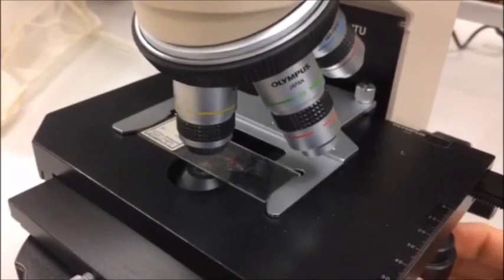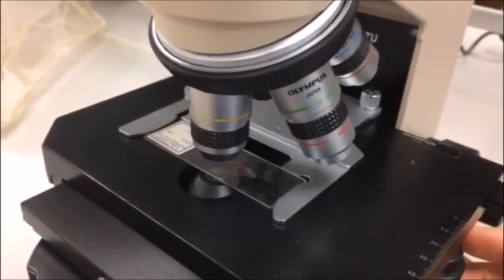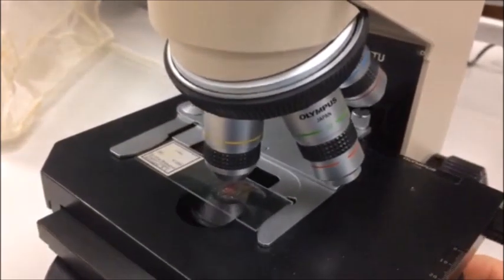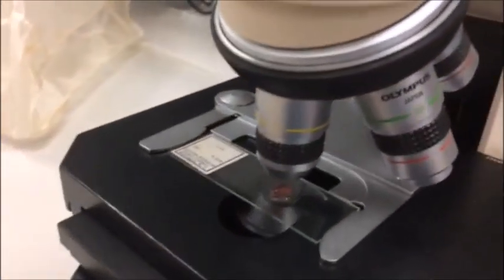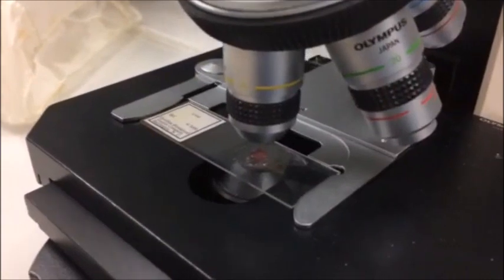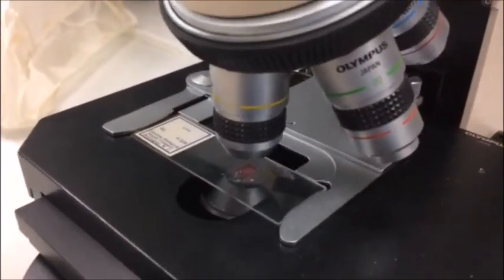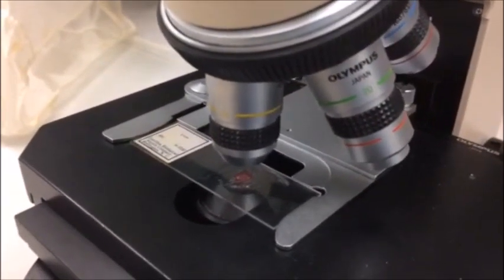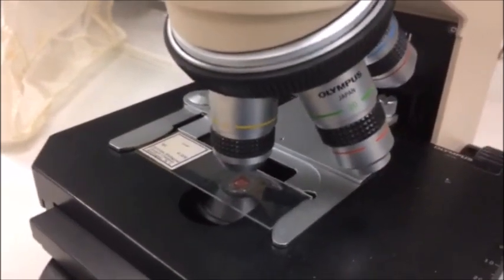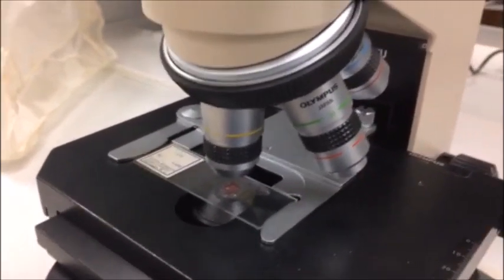One of the things that you can hopefully see is that when you have the slide over the light that's shining up from the condenser underneath, you can see a little spot of light shining on the specimen there. So that's how I know that the specimen is actually directly underneath the objective lens. So that's an important thing in terms of getting yourself oriented.